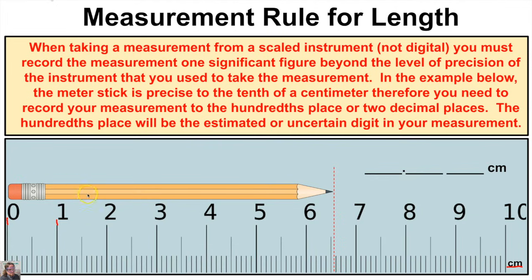Therefore, we have to go one significant figure beyond the 10th place in our measurement, or to the 100th place.